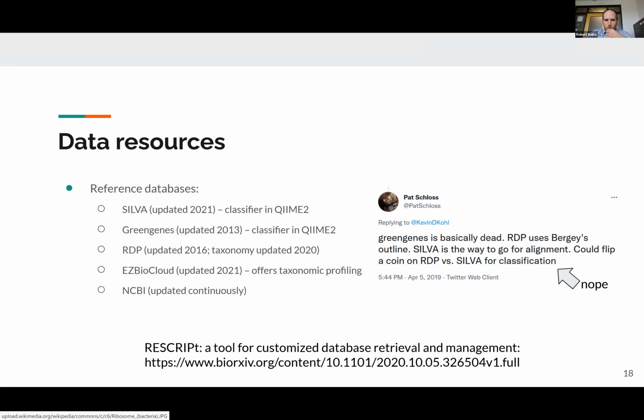The first thing I'll mention is that there are lots of different places you can get 16S data and other types of data, of course, as well, public databases. I mentioned Silva already. There's a list of other ones. And then you often also find habitat-specific ones. HOMD, the Human Oral Microbiome Database, is a good example of this. So lots of places to retrieve sequences.